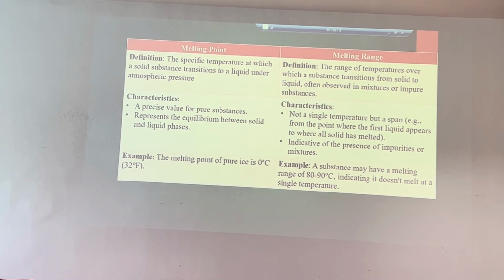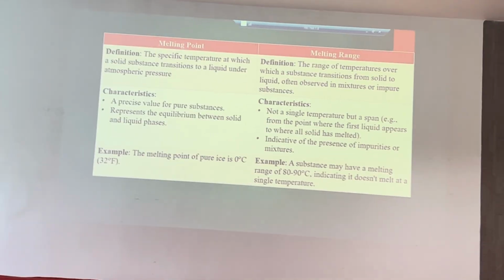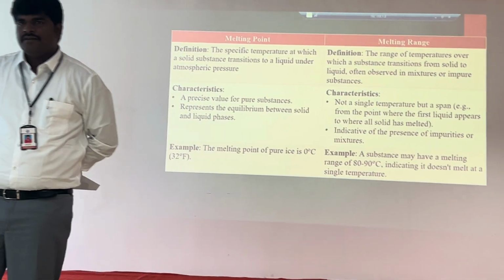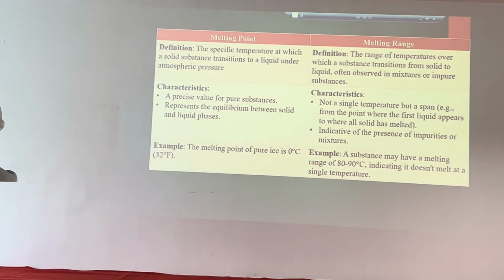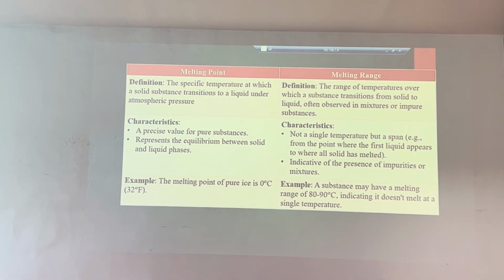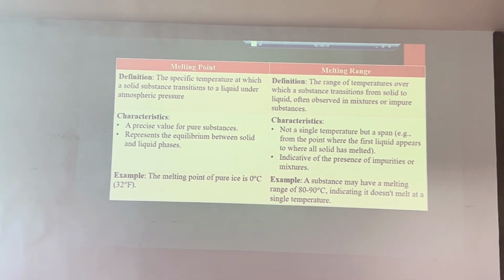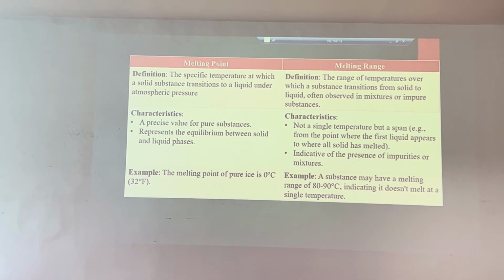And next. So what is the difference between the melting point and melting range? This is the only simple test we got to even in the last 6 months. This simple test only. But no one is believing that. Even it was not able to identify it during review also.